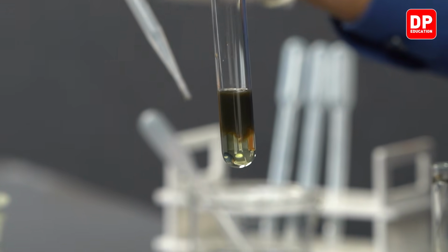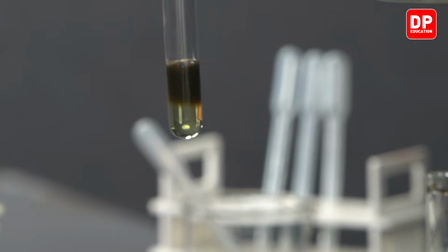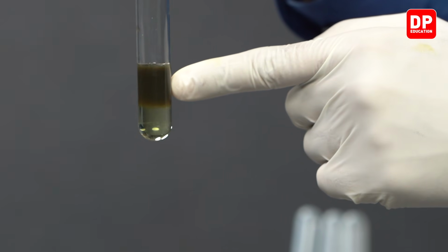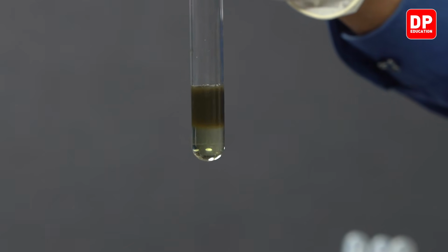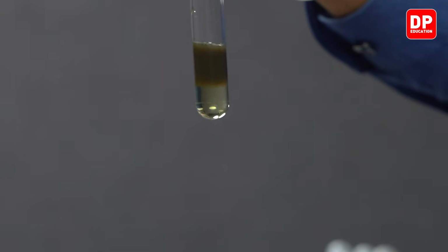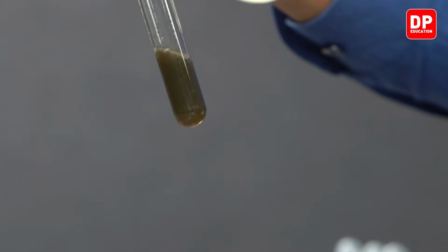You can see as silver nitrate is added to this sulfide ion solution, we started forming a black color precipitate here. And this black color precipitate that is formed is silver sulfide, Ag2S. So silver sulfide is again a black color precipitate that is water insoluble. We can mix it really well.